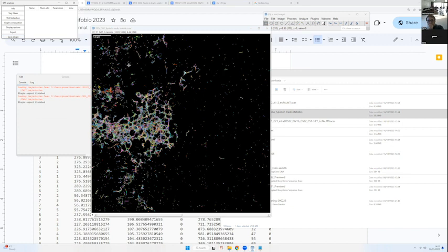And you load it. Maybe quick access. 299. Yes, click. Load. Good. Okay, yeah, I think we're good.